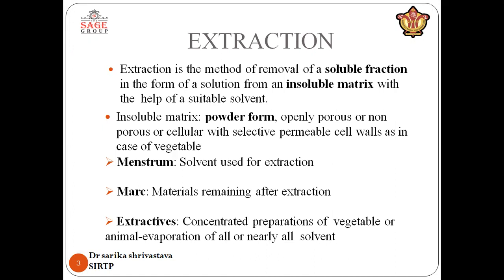The term marc is used for the material remaining after extraction. The extractive is the concentrated preparation of vegetable or animal material obtained by evaporation of all or nearly all of the solvent.